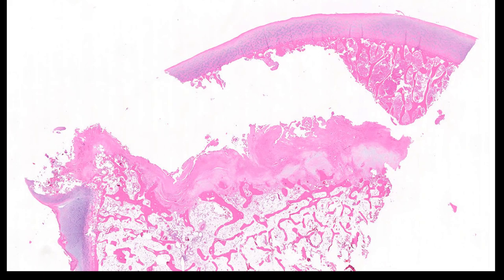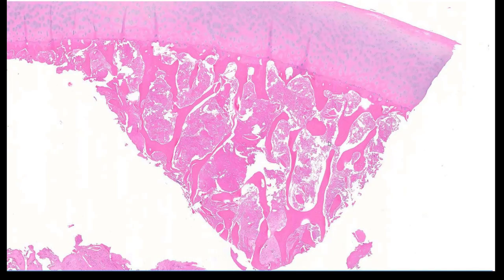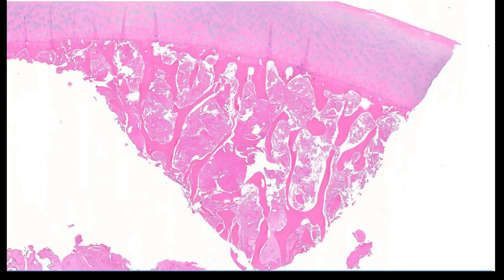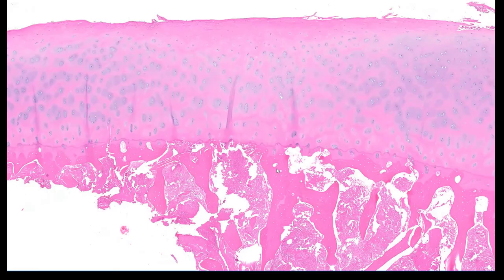In this case, there's actually fibrocartilage or callus-like material within the interface. So again, the top layer is intact articular cartilage, then dead subchondral bone. I can promise you that all of the osteocyte nuclei have dropped out. The marrow is dead as well, and is often filled with its eosinophilic, proteinaceous, junky, monkey-like appearance.